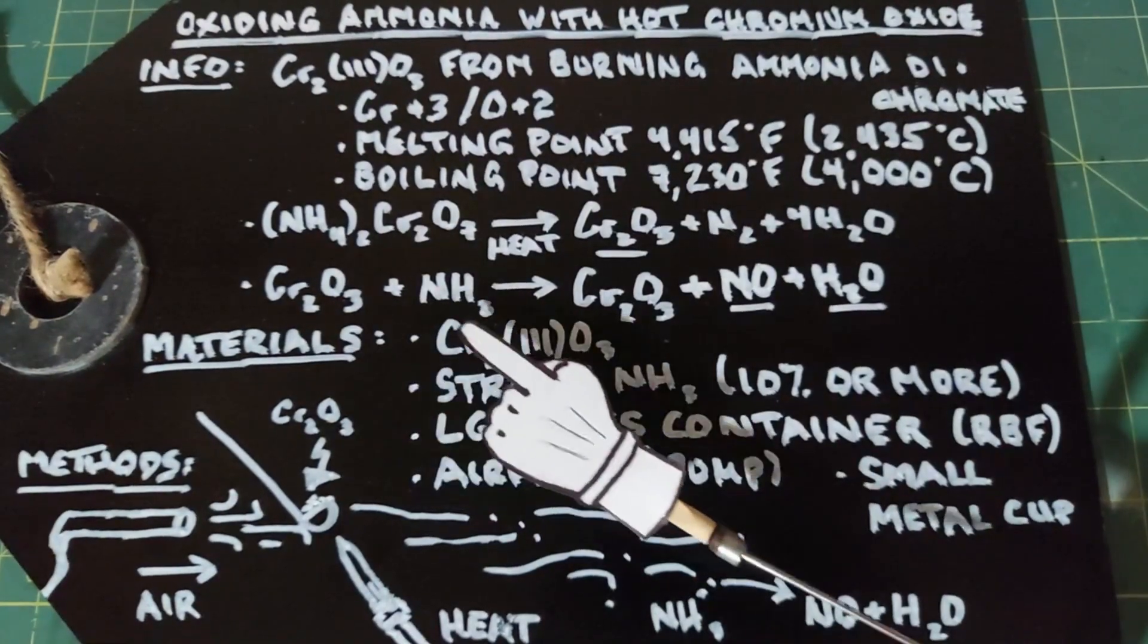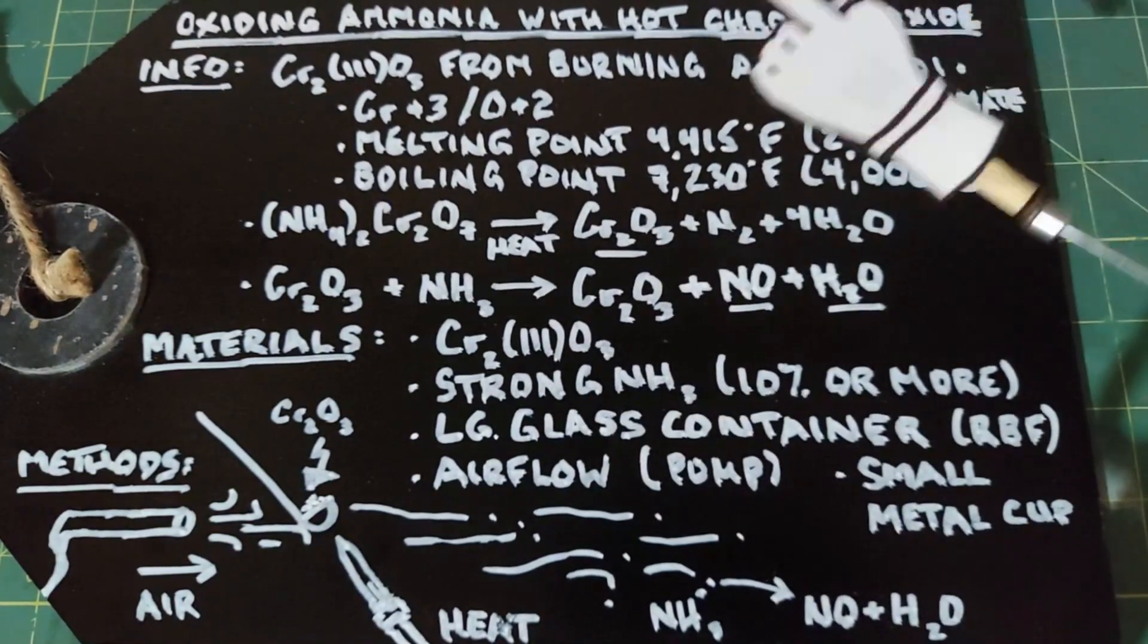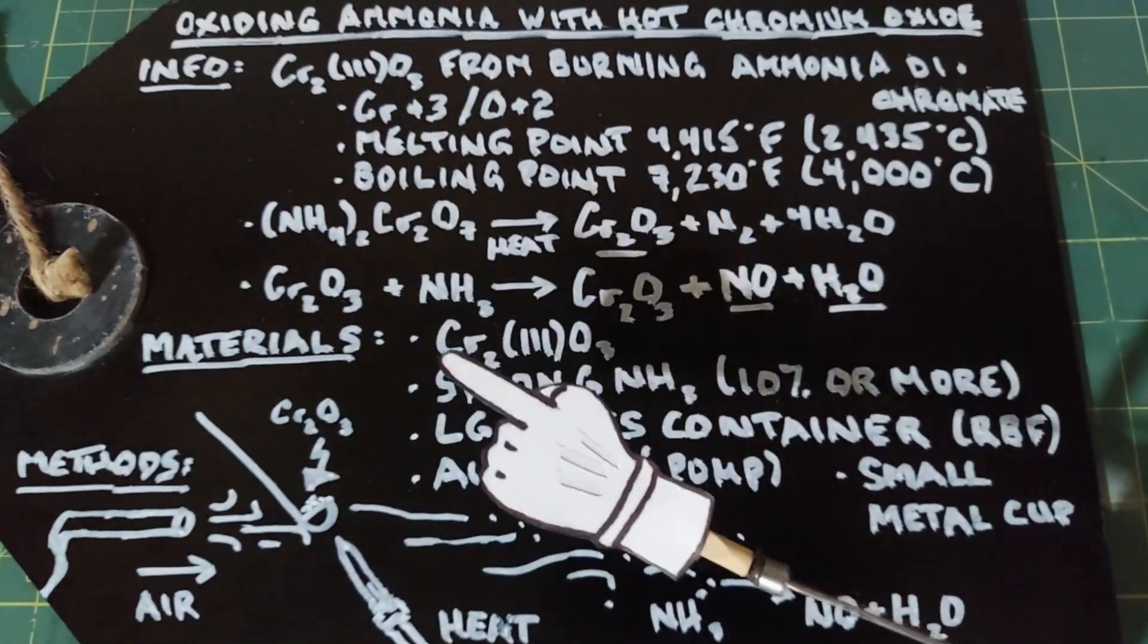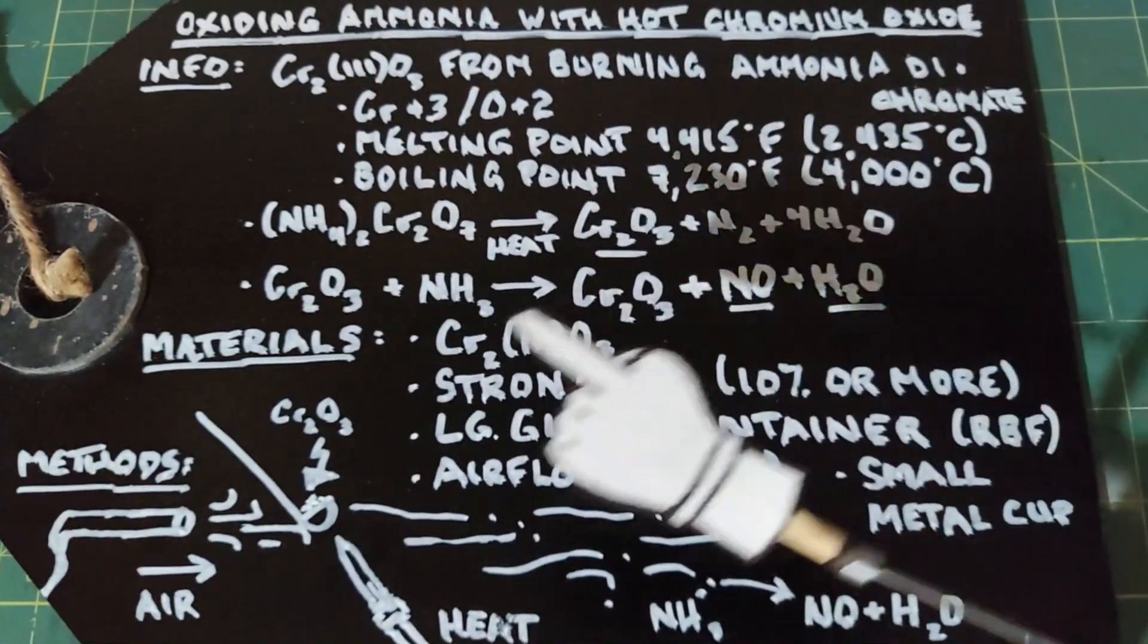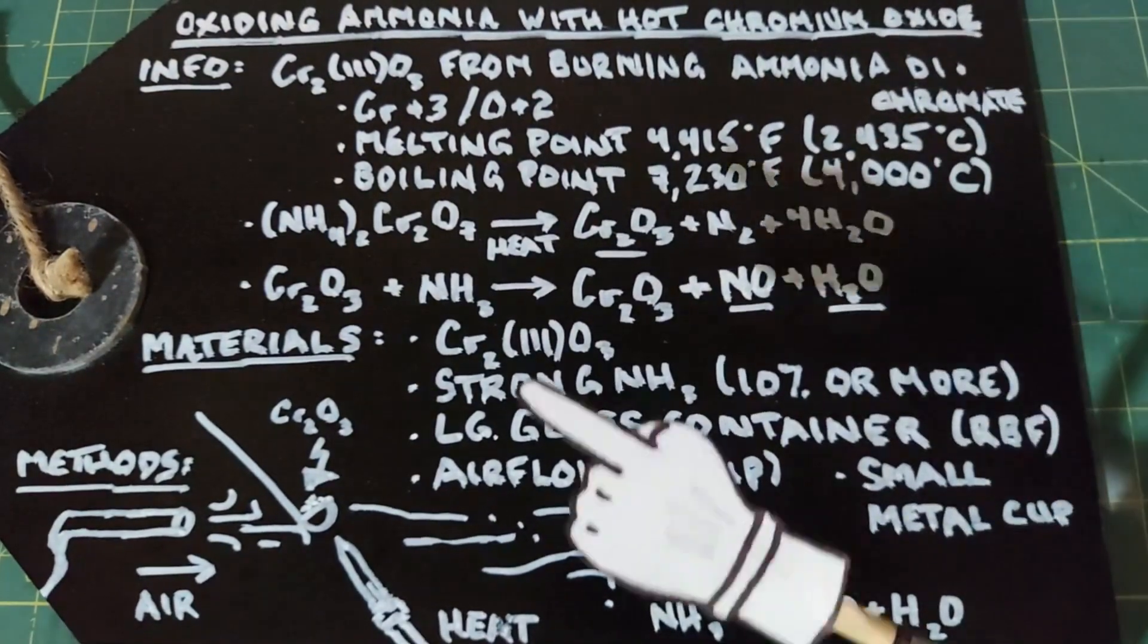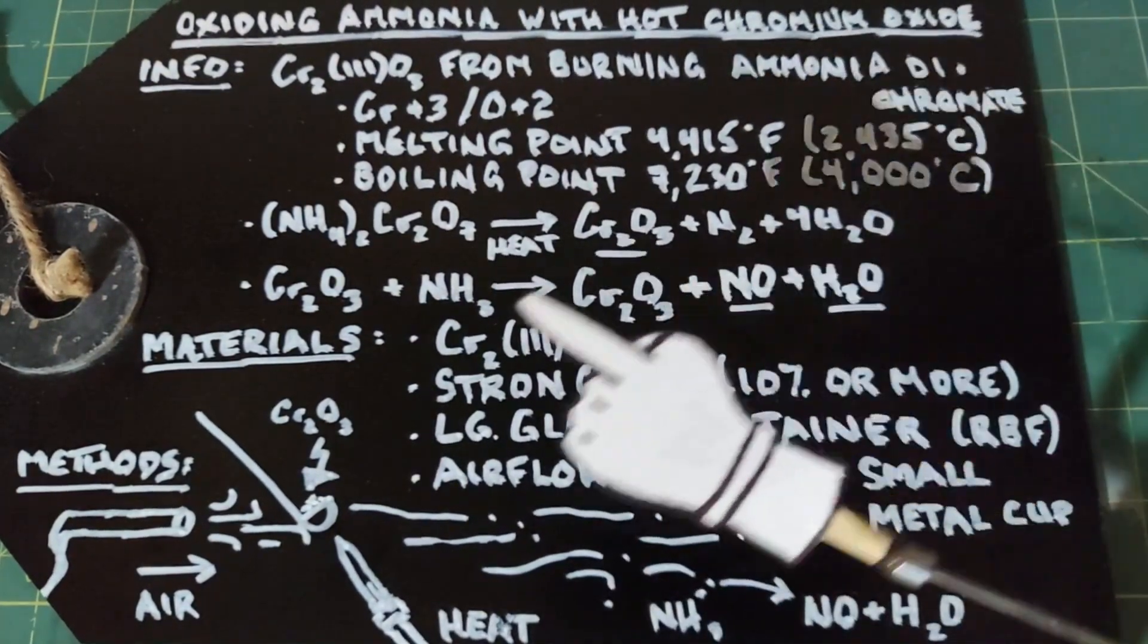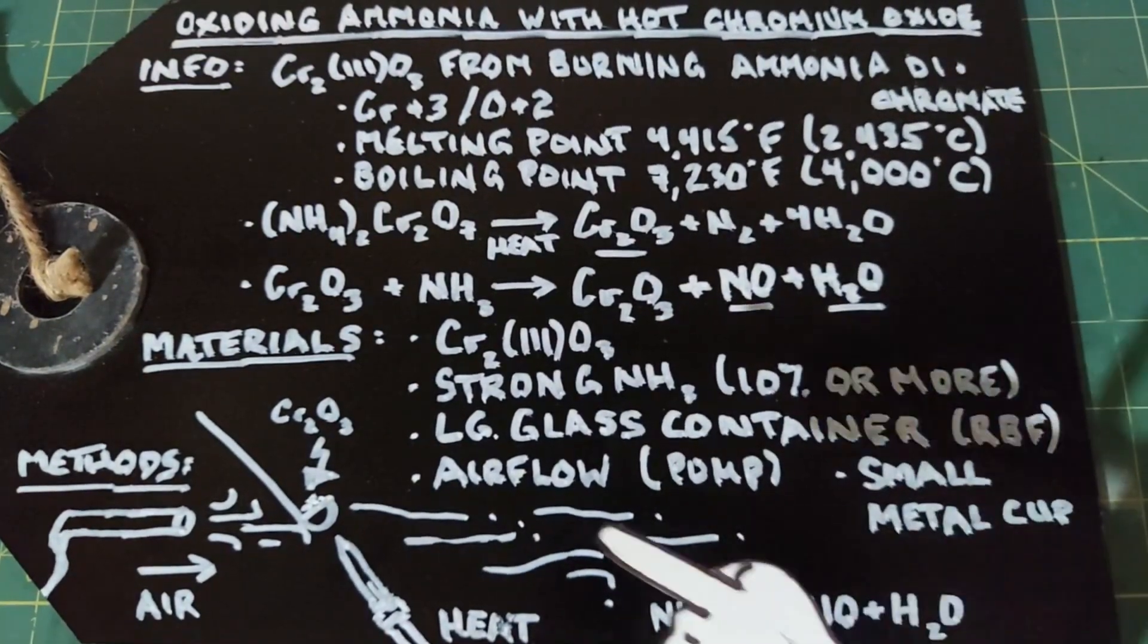For our materials, we need the chromium(III) oxide which we're going to get from burning ammonium dichromate. We need some strong ammonia, 10 percent or more. We need a large glass container—I'm going to use a round bottom flask. We need some airflow, a source of heat to heat the chromium oxide, and a small metal cup to put the chromium oxide in.